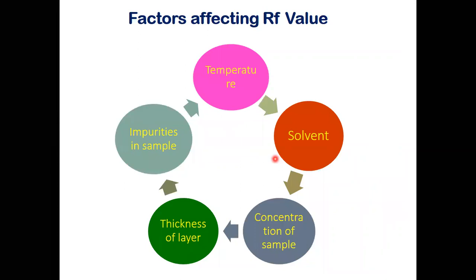TLC plates: always use TLC plates with minimum thickness of the stationary phase. If the sample has impurities, then unnecessarily it will produce different spots on the TLC plate.